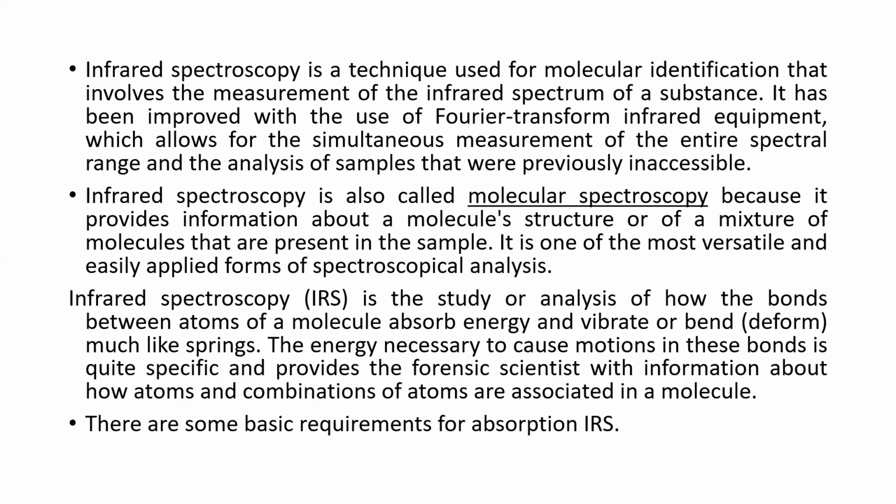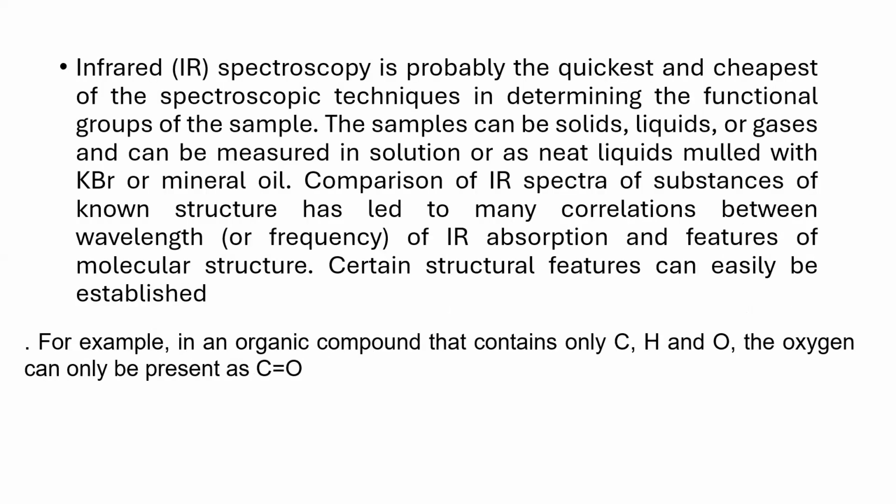So when I say IR spectroscopy, as a technique for analysis, it is very simple, quick, and economically also very approachable, a very cheap method to say. So that is one thing.